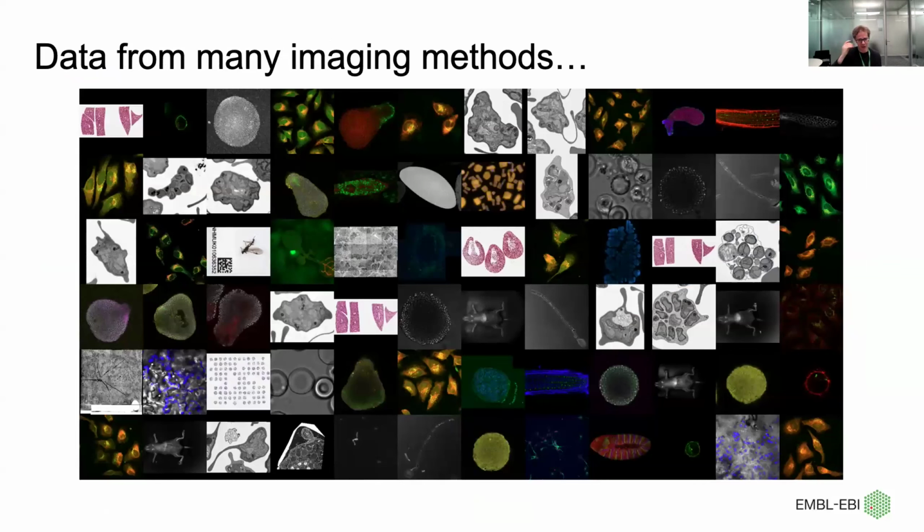This is a small subset of thumbnails and images that we hold, and it includes lots of fluorescence microscopy, as you can see, and light sheet among those. There is whole slide imaging, histopathology. There are 2-dimensional EM images. There are slightly more unusual things like shortwave infrared. And this slide over here is part of one of those biodiversity museum collections, so it does include this large scale macroscopic organism scale, not traditional microscopy.